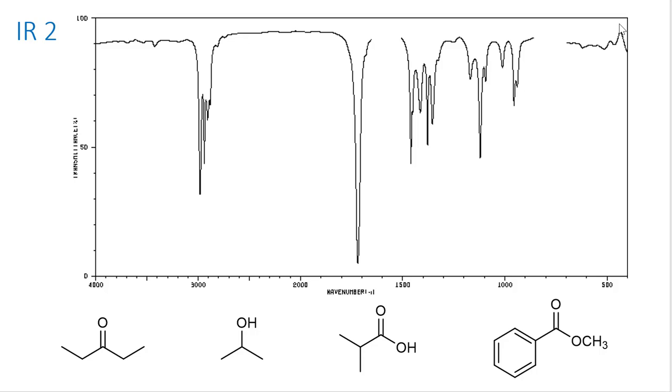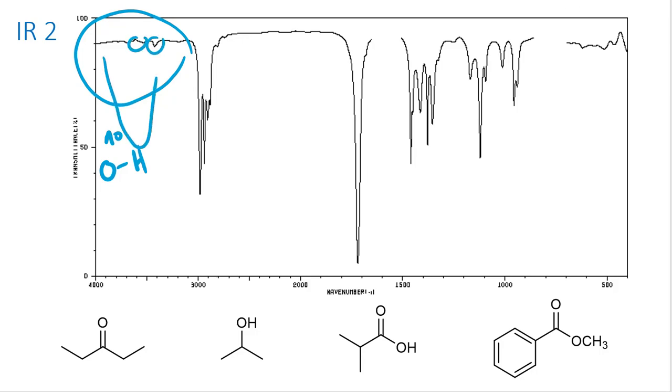In this case, we don't see an OH bond stretch or bend. If there was something here, it's not going to be these little things. It would be a big absorbance, and the absence of which means we can rule out two of our structures at least.